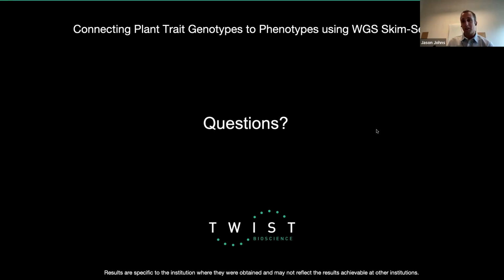I know there are tools out there that can help resolve a lot of that. Fortunately, I haven't had to use them because now we're able to get 20 kb reads and do things like Hi-C, and even longer than 20 kb reads, to be able to resolve some of those repetitive regions of the genome and do real high quality chromosome-level assemblies.